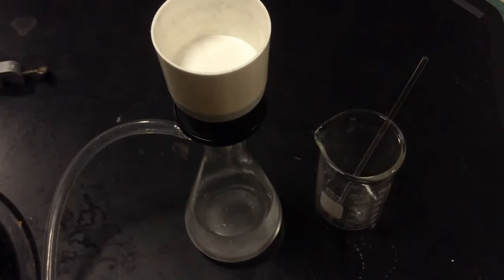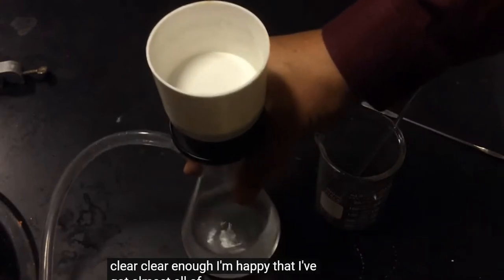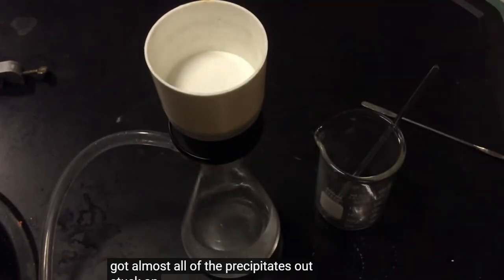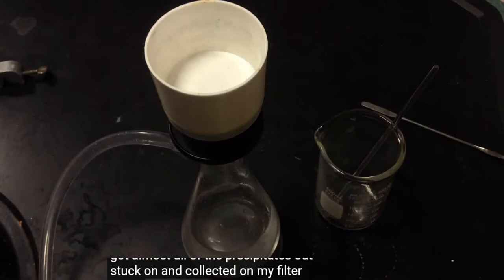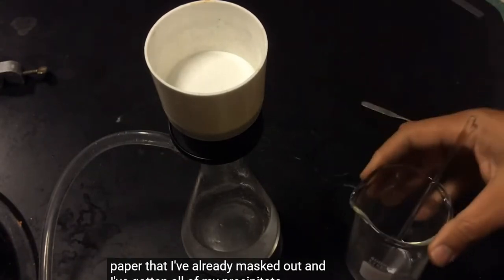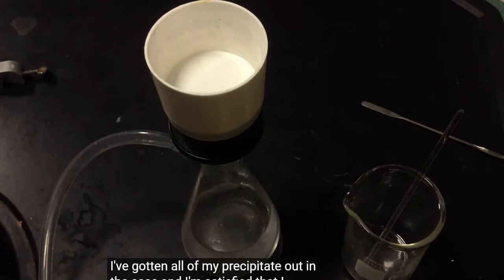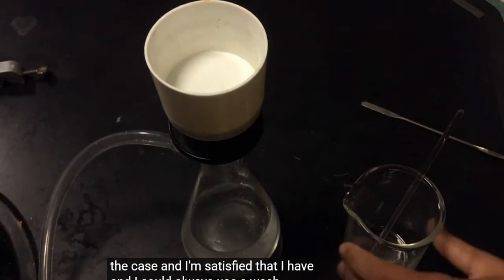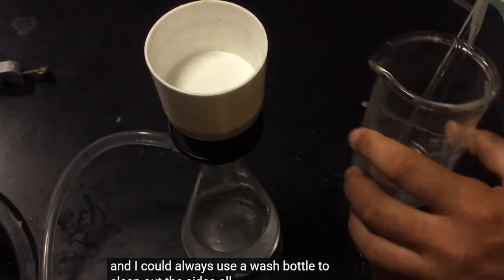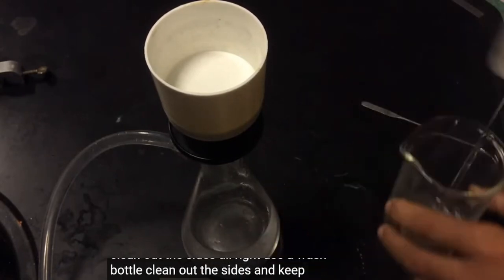So as you can see, my filtrate is pretty clear. I'm happy that I've got almost all of the precipitate out, stuck on and collected on my filter paper that I've already massed out. And if I'm dissatisfied, I can always use a wash bottle to clean out the sides, keep filtrating, or take some of this filtrate out.